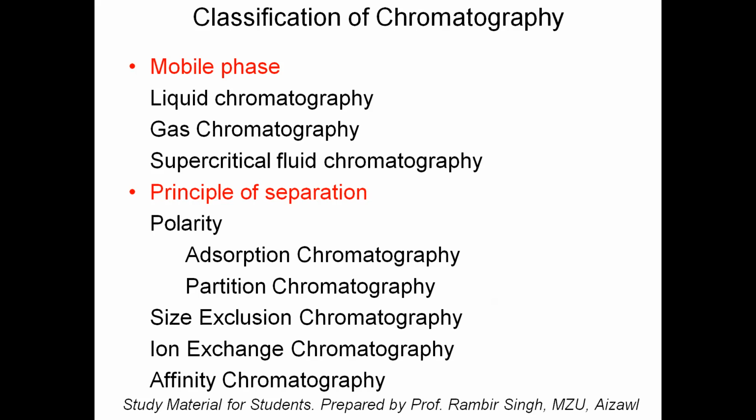Suppose my interest is only in the negatively charged anionic proteins, so I can make the stationary phase positive, so that the rest of the proteins are flushed out and only the protein of my interest is adsorbed, and I can filter out the unwanted proteins from the mixture. This was a pre-separation kind of concept that can be done very easily.